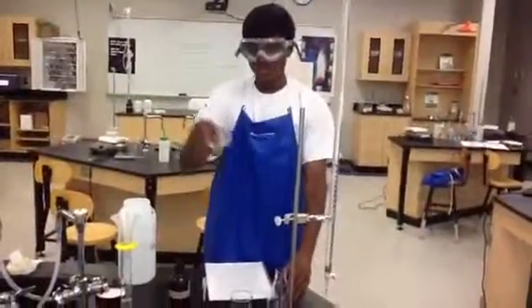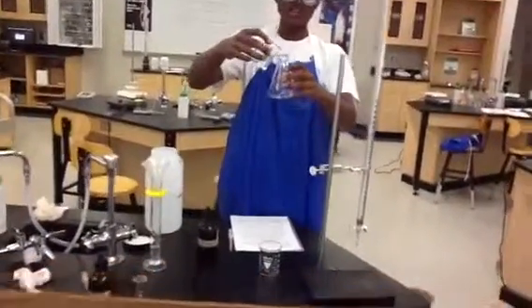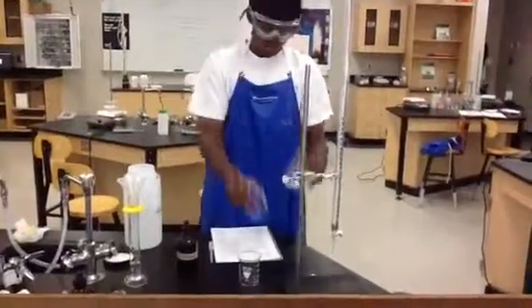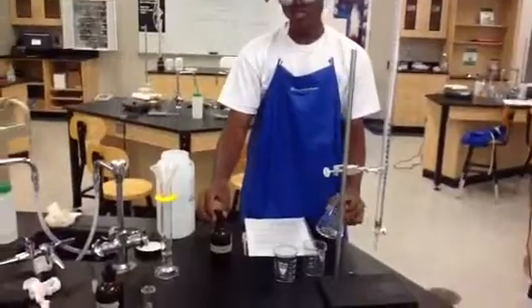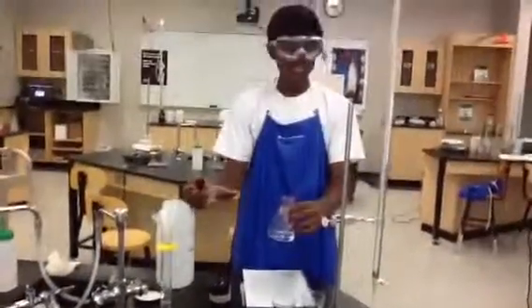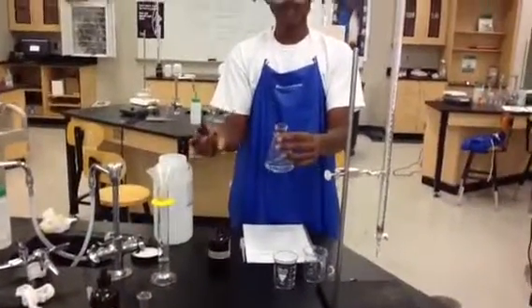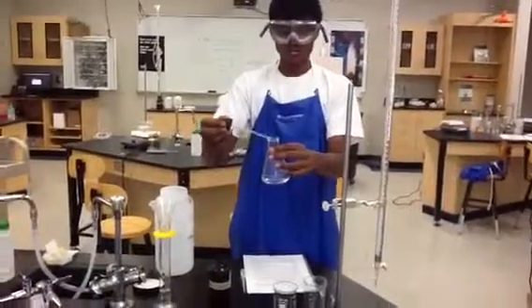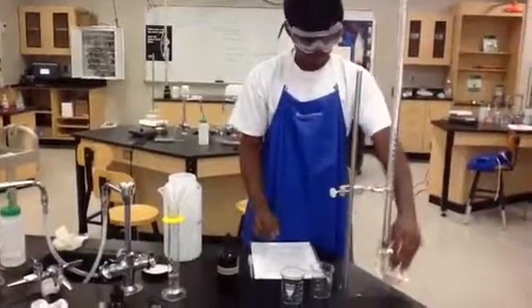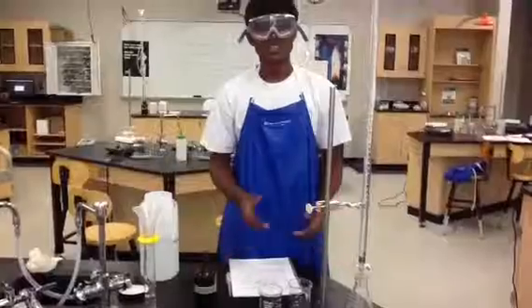So now guys, you're going to measure 50 milliliters of acid and pour that into the flask. Now we also need to add 2 to 3 drops of phenolphthalein into the flask. The phenolphthalein acts as an indicator, and it tells us when the color changes, and that's what we need to find, the equivalence point. So I'm going to put that under the burette. And now you're ready to start the titration itself.